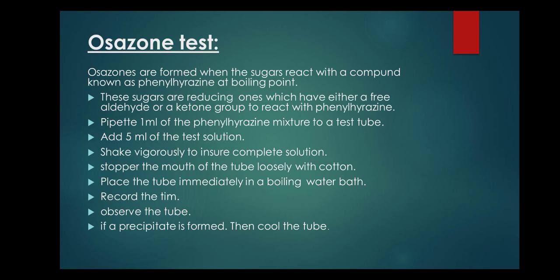Osazone test. Osazones are formed when the sugar reacts with the compound known as phenylhydrazine at boiling point. These sugars are reducing ones which have either a free aldehyde or ketone group to react with phenylhydrazine.